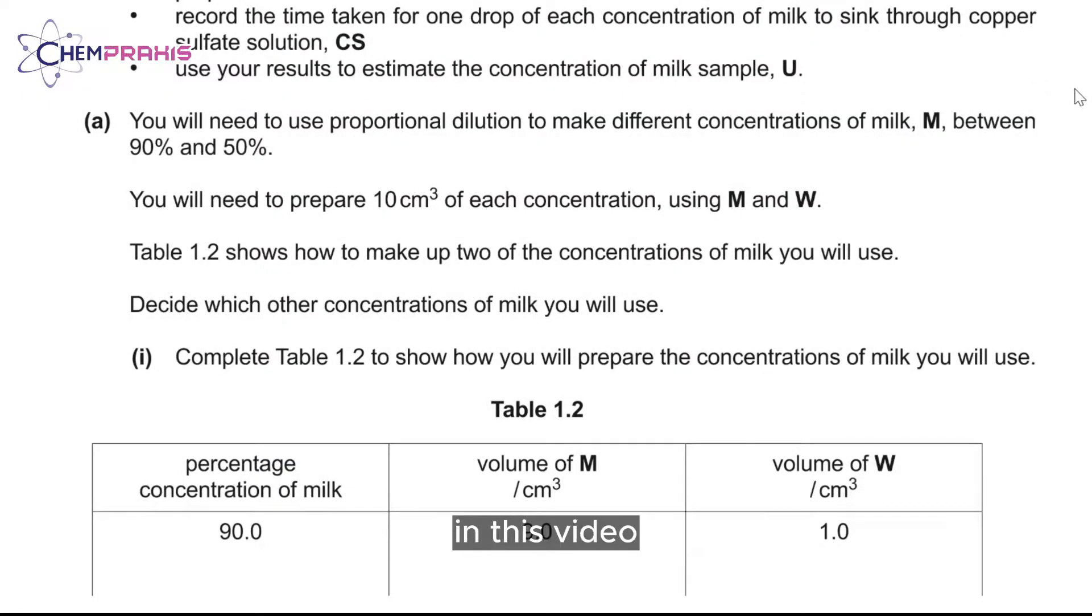Hello, we're from CAMPRAXIS. In this video, we'll be carrying out a proportional dilution, also known as simple dilution.